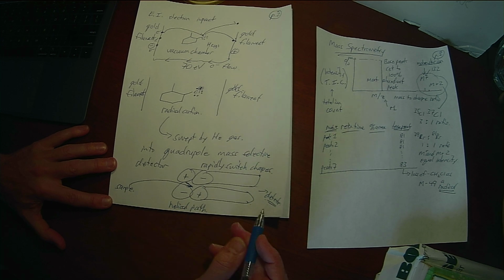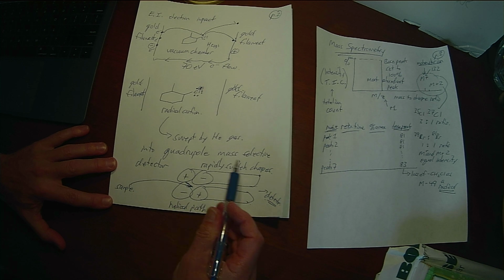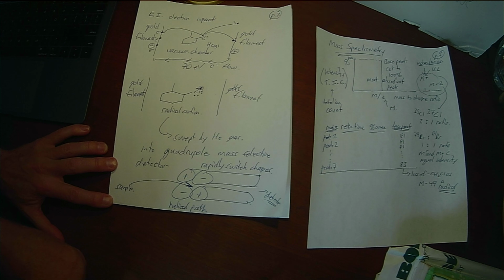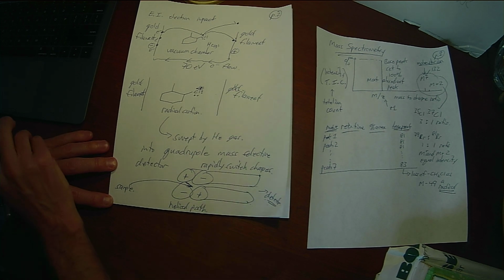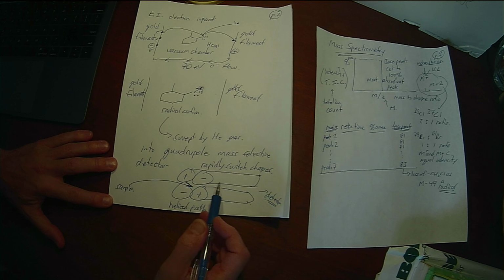It's a relatively low resolution mass spectrometry technique, this kind of quadrupole that we're looking at. It's not the one you would have seen in your textbook for general chemistry, which is a more expensive instrument. But the GC mass spec with this quadrupole detector only costs about $70,000, and a full-on mass spec of the type that you see in the Gen Chem text costs $500,000. So obviously we can't afford that. So we've got this quadrupole detector.